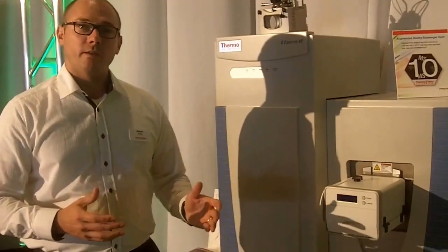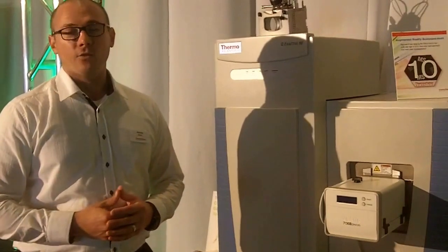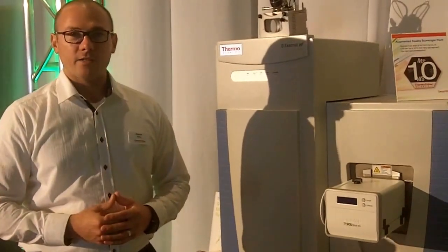Previously, a few years ago, on the X-Activ Plus EMR, we launched an instrument that was not mainstream, and for those who were using it, they realized that this is really the best intact protein instrument out there.